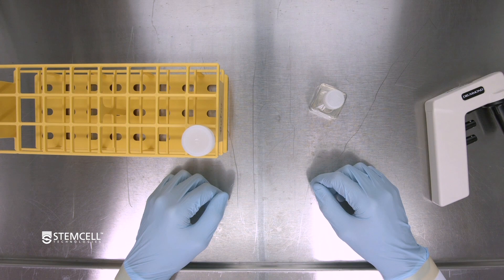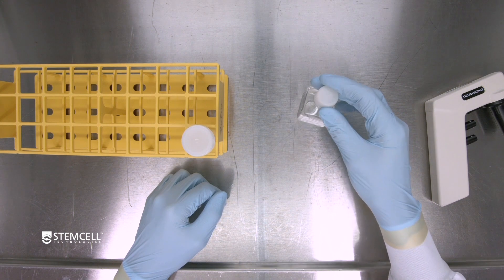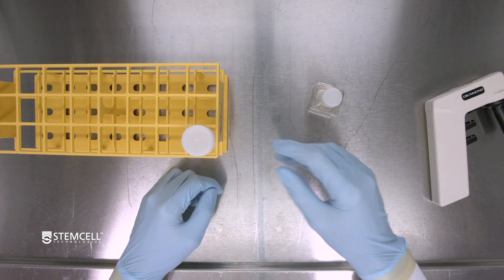The materials you will need to feed a PBS Mini 100ml bioreactor are TeSR AOF feed media and a 50ml Falcon waste tube.